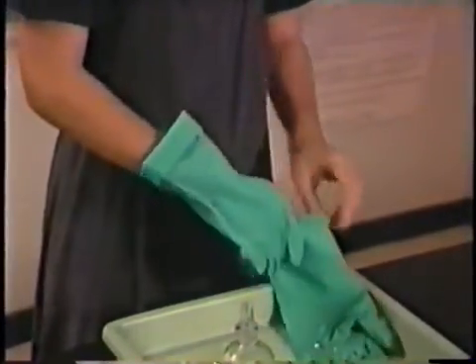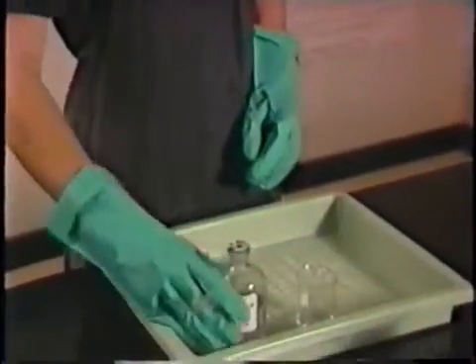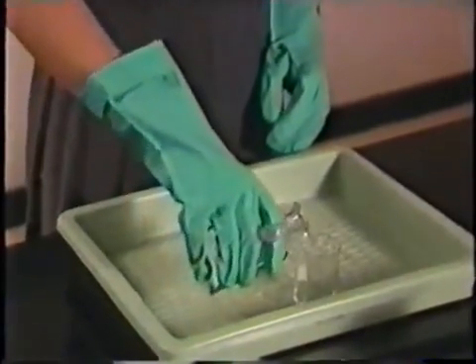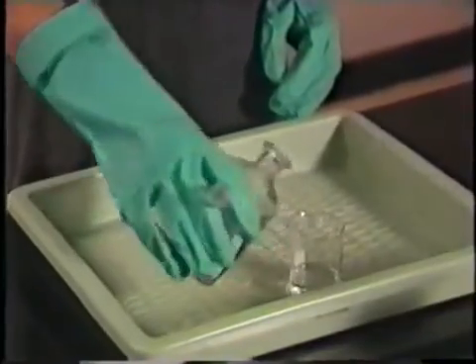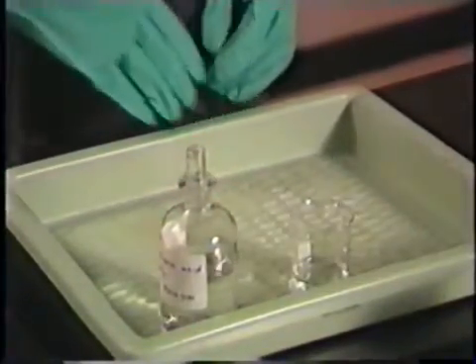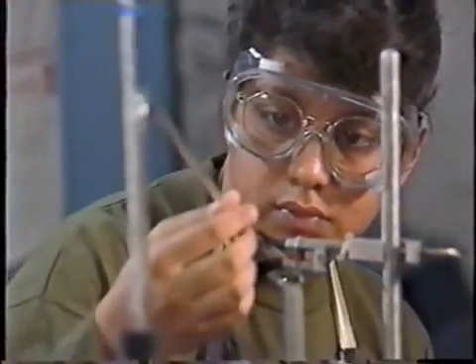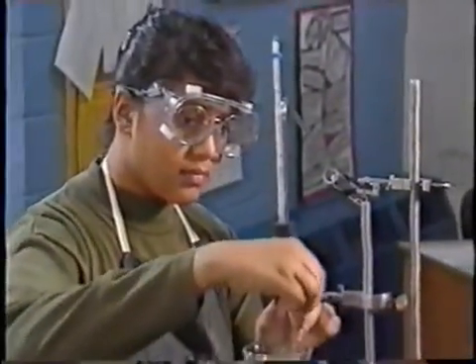Finally, protect your hands. Never use bare hands with concentrated acids, bases, or other reactive chemicals such as concentrated hydrogen peroxide. Your teacher will tell you what type of gloves to wear to work with these chemicals. With the right clothes and protective equipment, you can work with laboratory chemicals with confidence and safety.